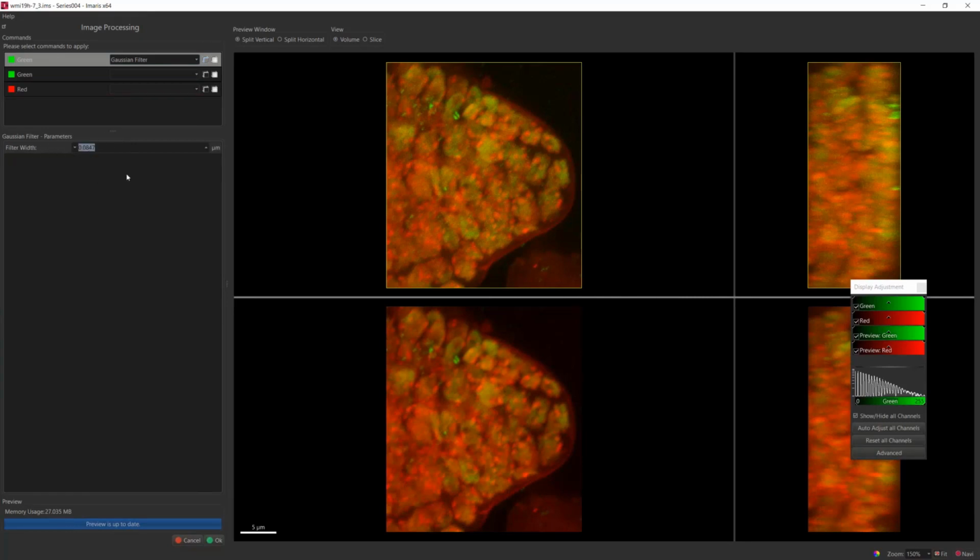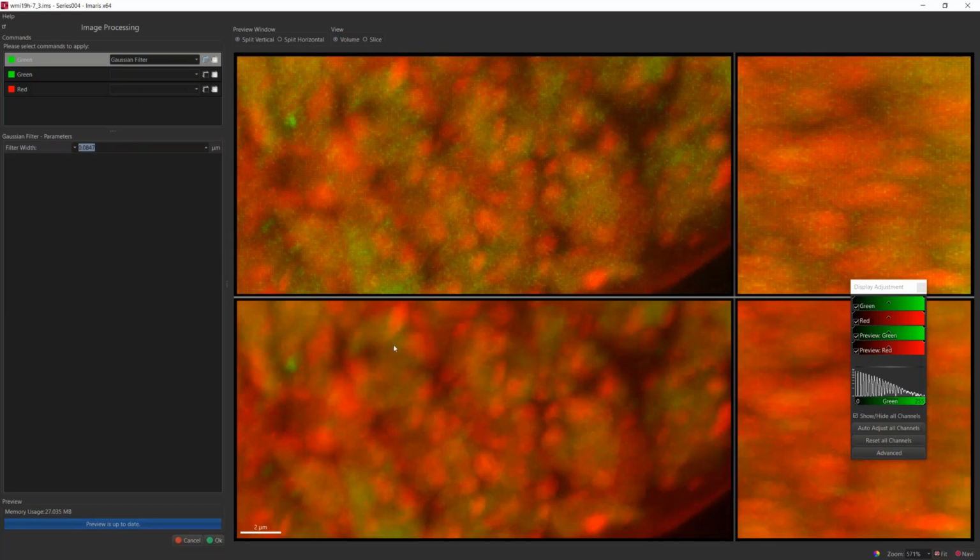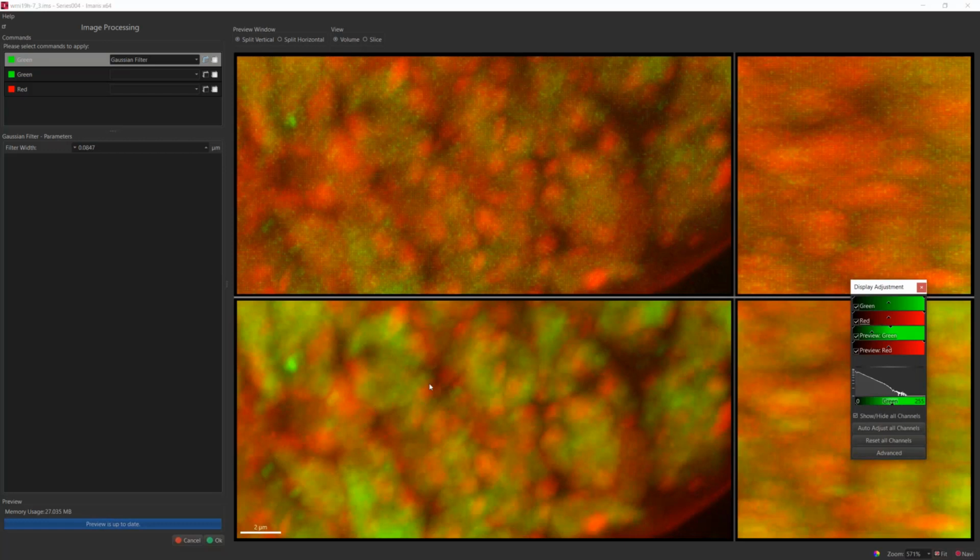You can think about the filter width as what you want to preserve as the smallest feature in the image. In the case we just discussed, what we want to detect is the much larger feature, for example, here, whereas the variations that we see in the original image are at a much smaller scale. That's why applying a Gaussian filter, where we can smooth out all these smaller variations, can help us with the object detection better, especially if what we're trying to detect is much larger than the original image resolution.